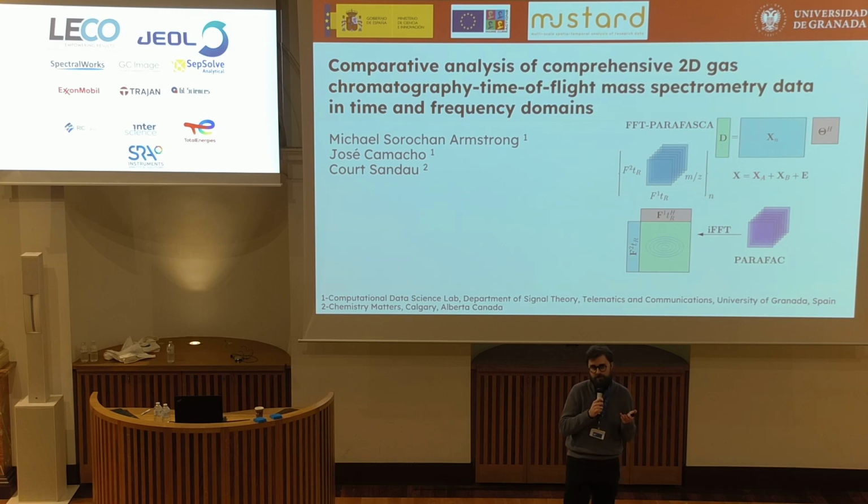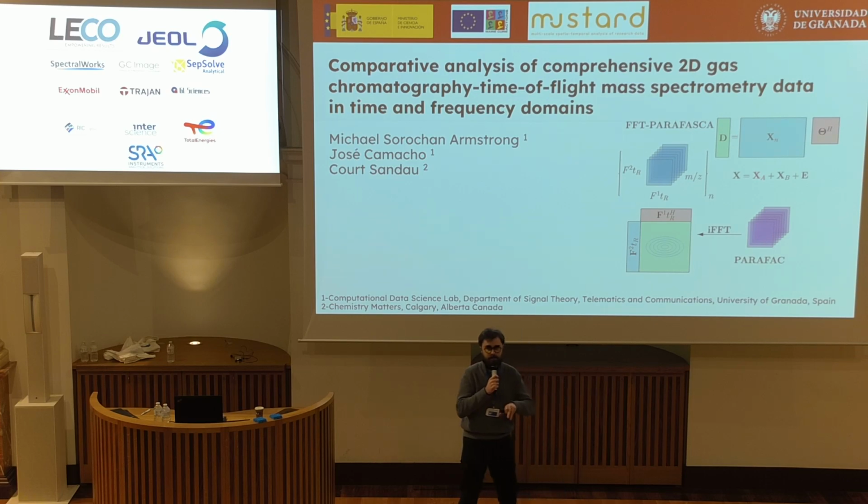So maybe for some people in the regulatory industry, you do need to know every single chemical component. But if you're looking for just the chemical components that differentiate, I would invite you to maybe look at the frequency domain. I gotta go quick, but again, thanks for having me.